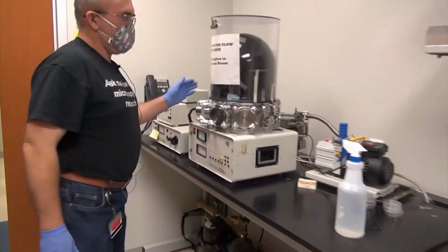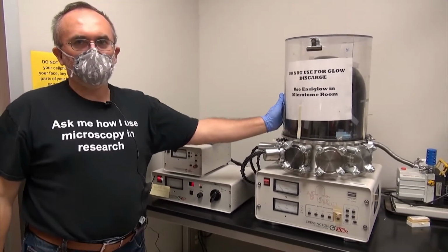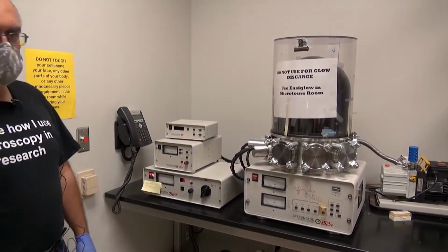For cases where we need to apply a thin layer of carbon, we have a carbon coater instrument here.